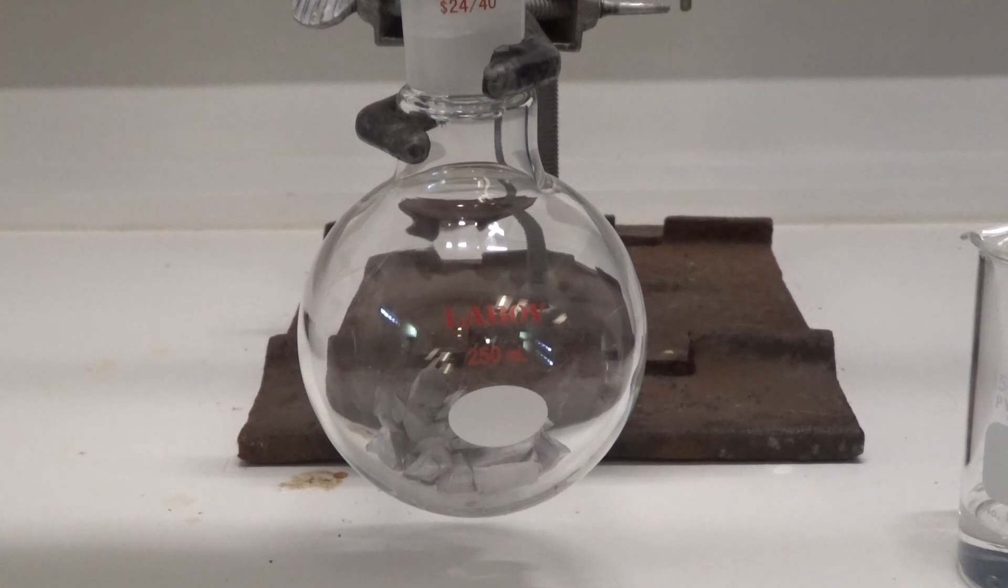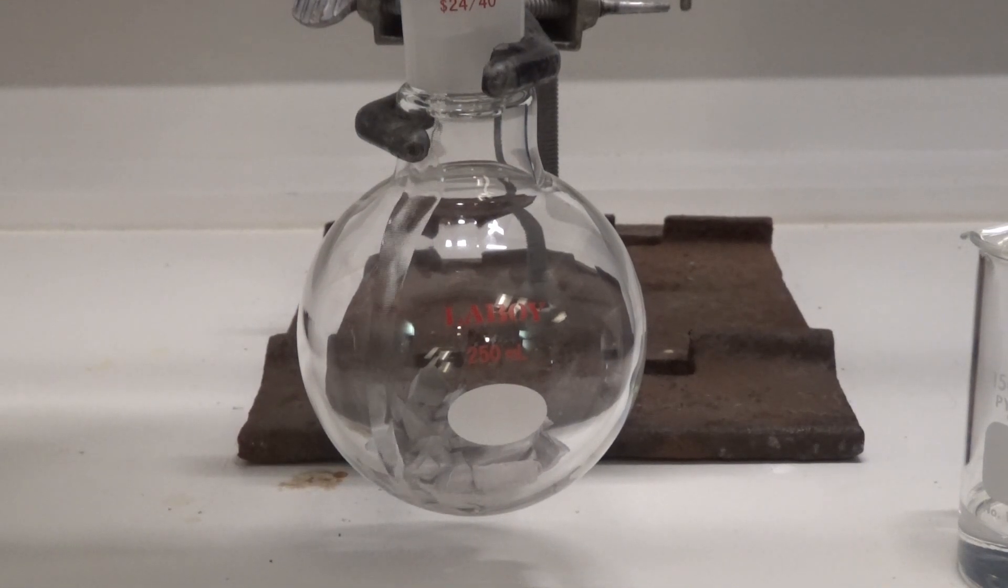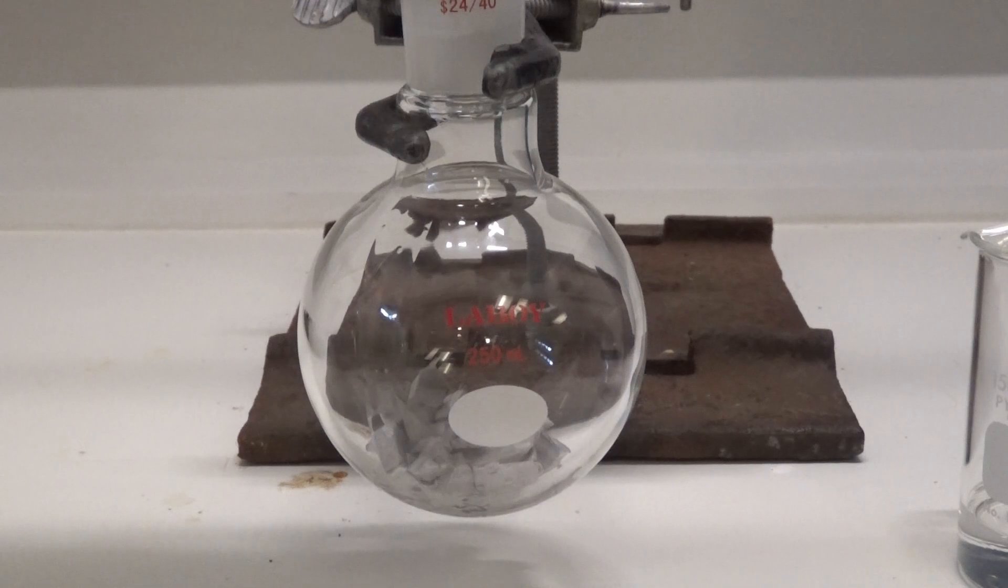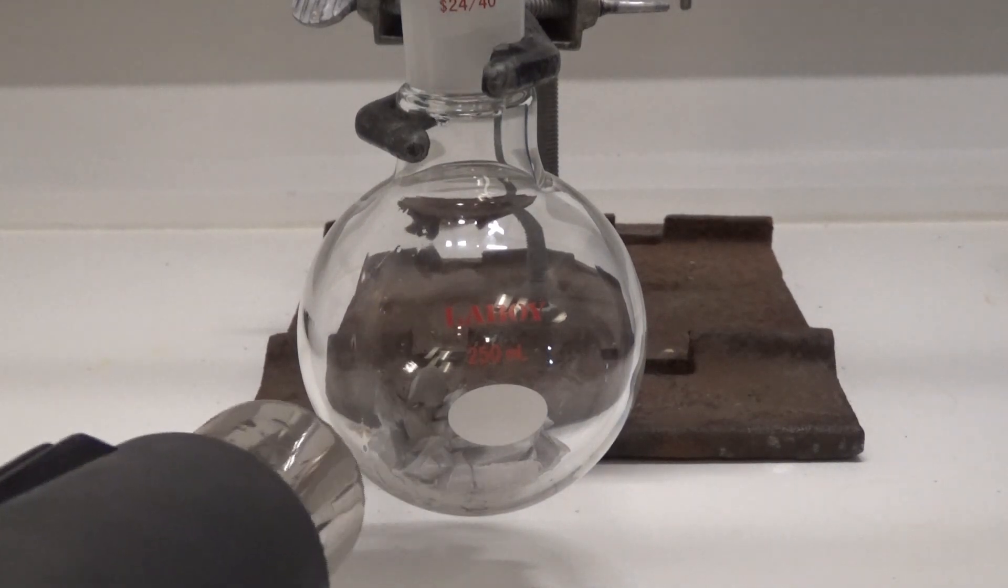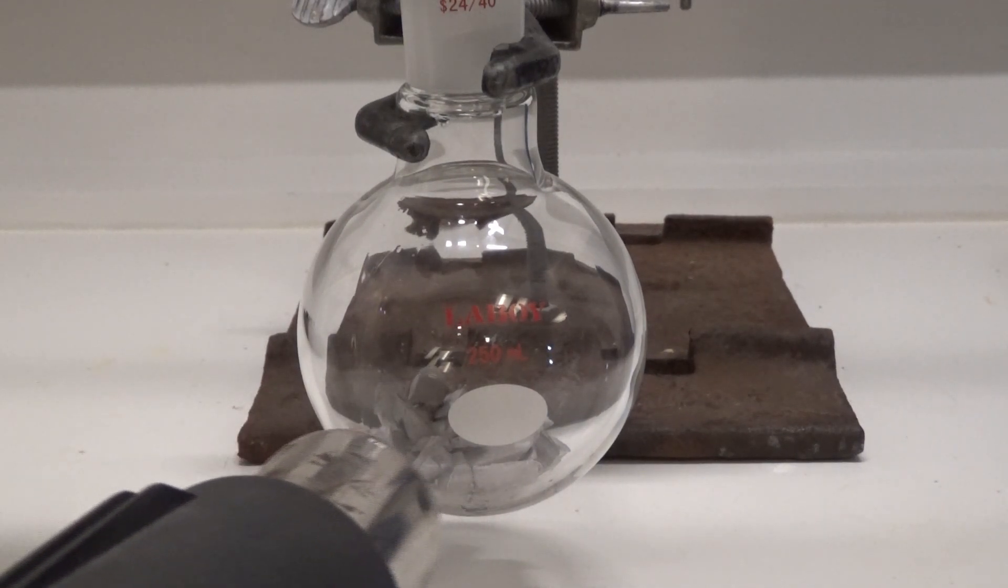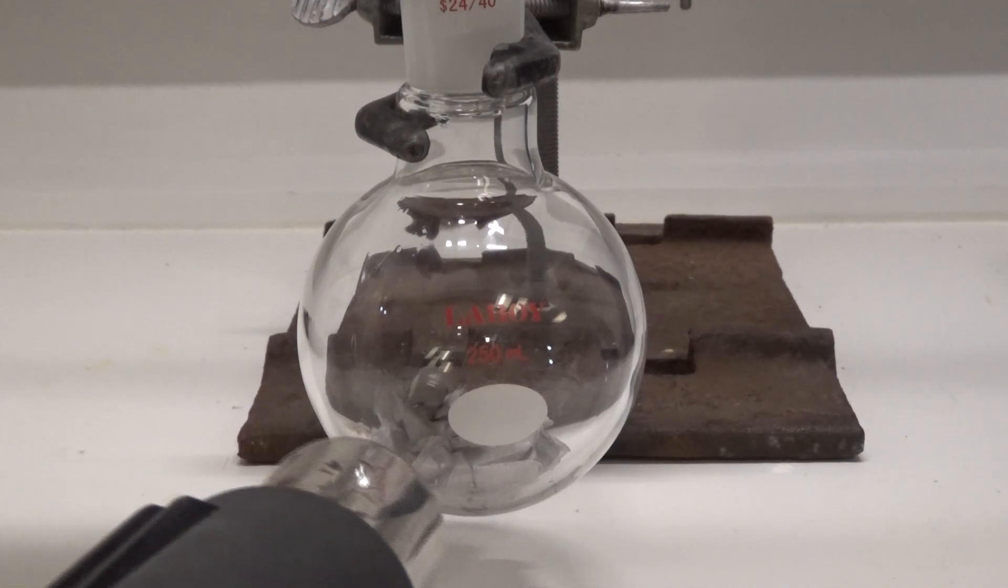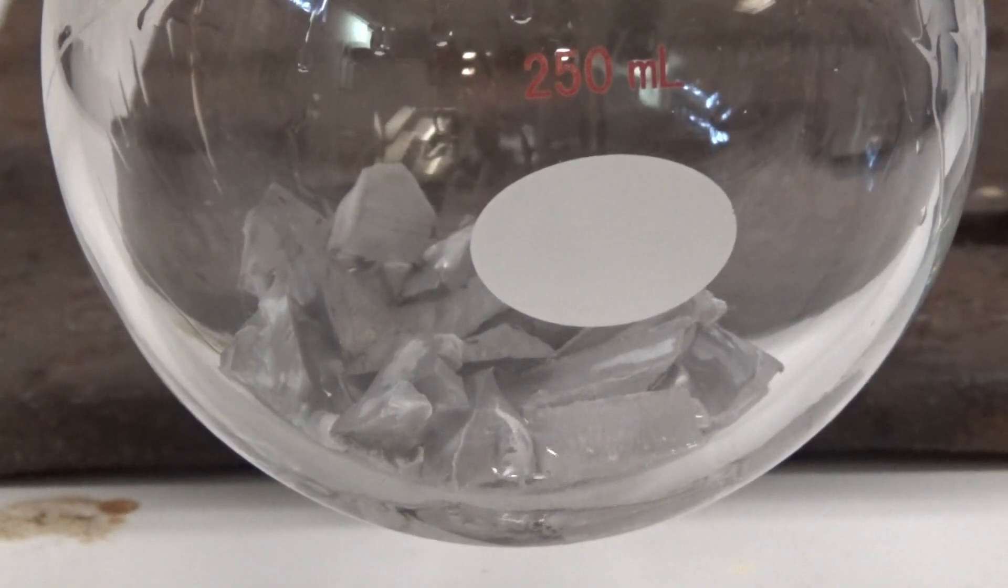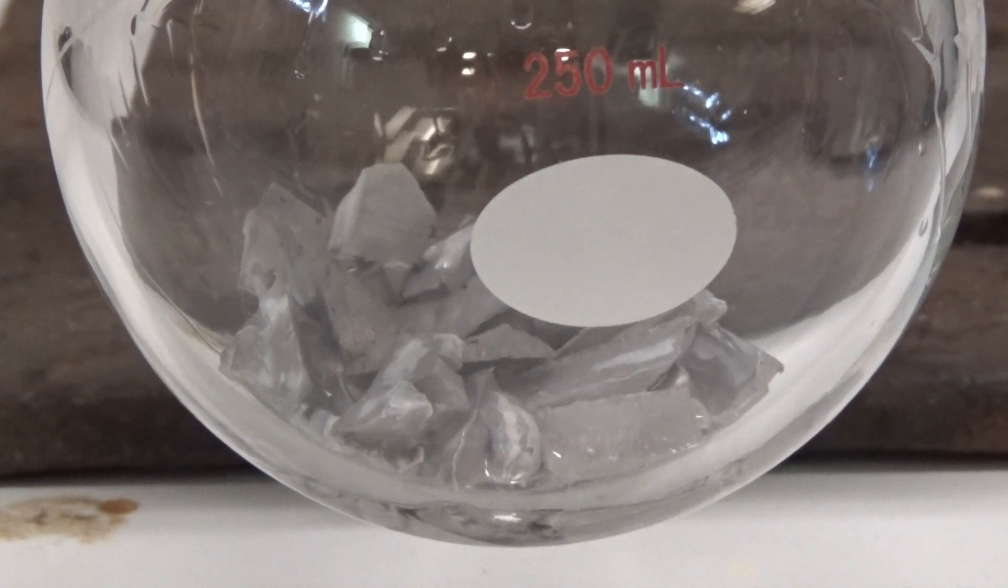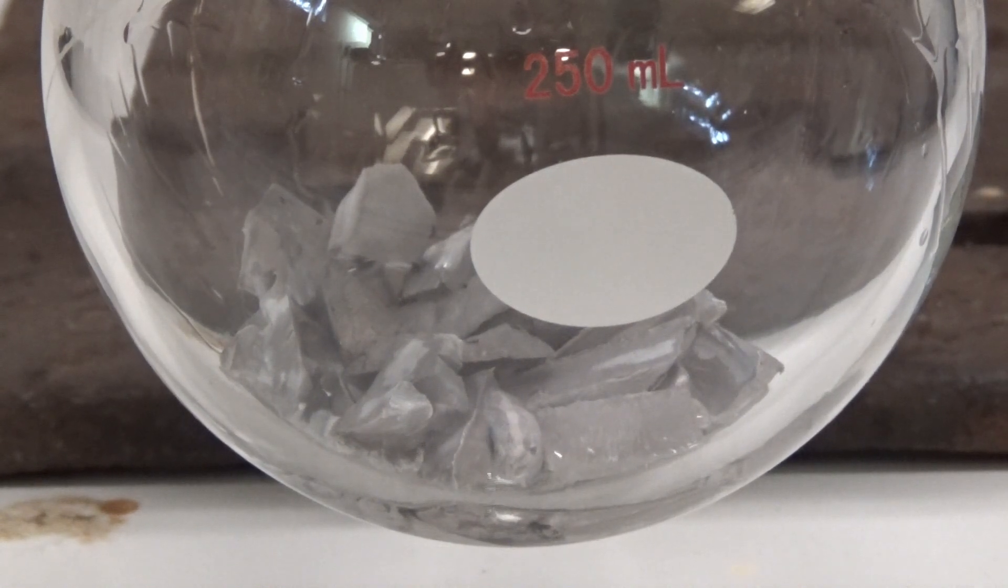I slowly dripped in the 1,3-dibromopropane, and it didn't really seem to do anything. I then added a bit more, and when there was no significant exotherm after a while, I started heating the flask gently with a heat gun. After hitting about 130 degrees, a reaction finally kicked off.